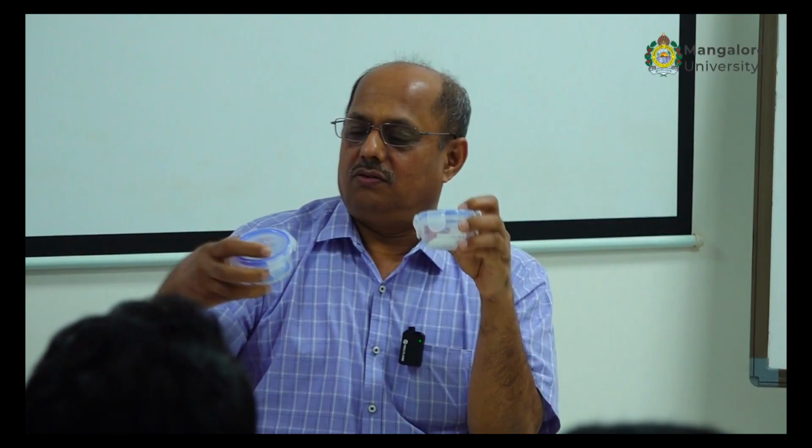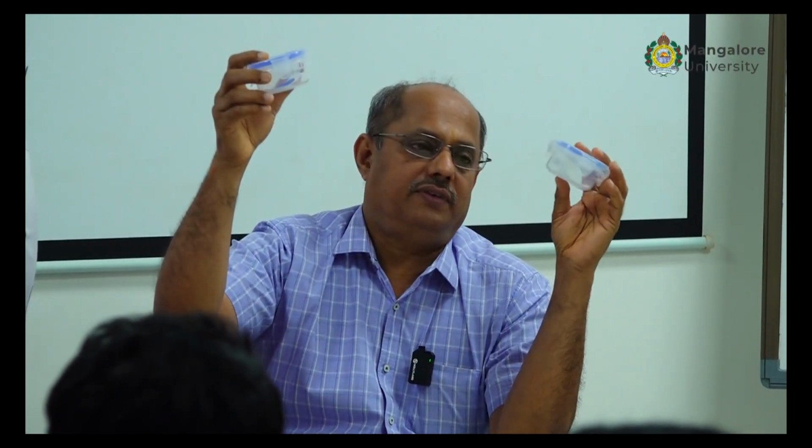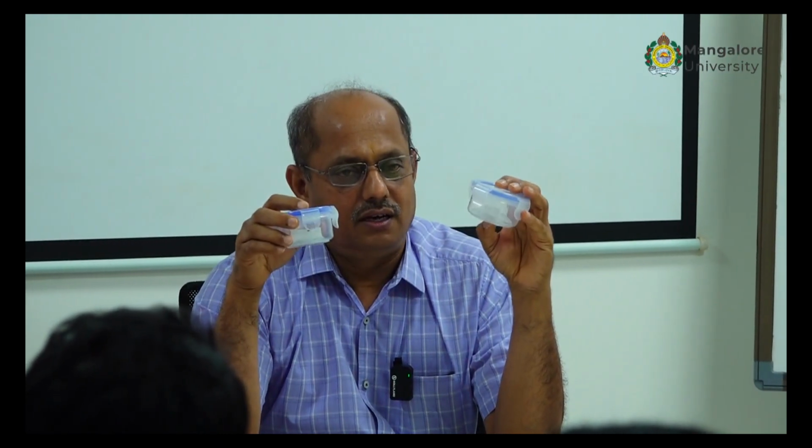And second is, we have a set of filter papers. One is blank, one is standard, one is unknown. We have a set of filter paper. One is blank, which is expected to have zero activity, background. And we have another filter paper with the reference, where the activity is already spiked. And we have one unknown. This also you can put it to counting in another detector. Meanwhile, the standard reference material sample spectra we will also give you.